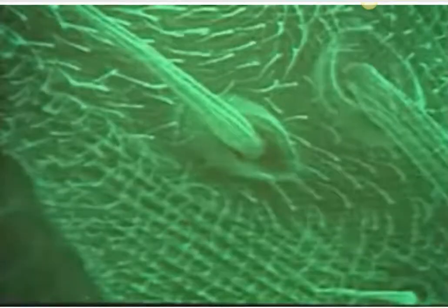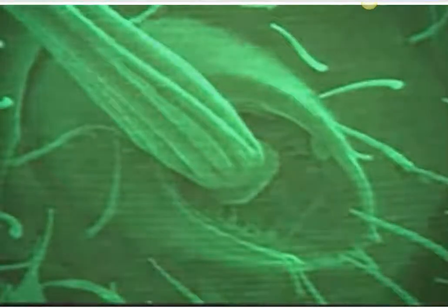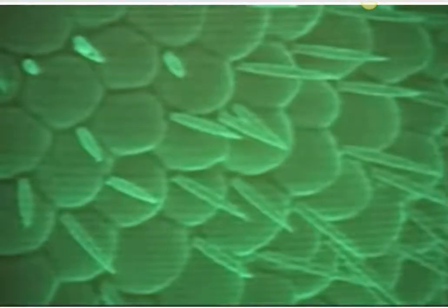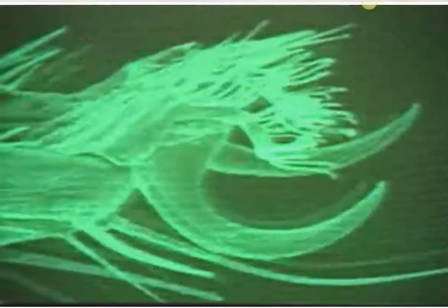Here we're zooming in on a sensing hair on the fly's head. Now we're zooming in on the fly's eye, and we can see it is made up of thousands of smaller eyes and dotted with sensing hairs. And finally, we zoom in on one of the fly's legs and discover claw-like feet that enable it to cling tightly to just about any surface.